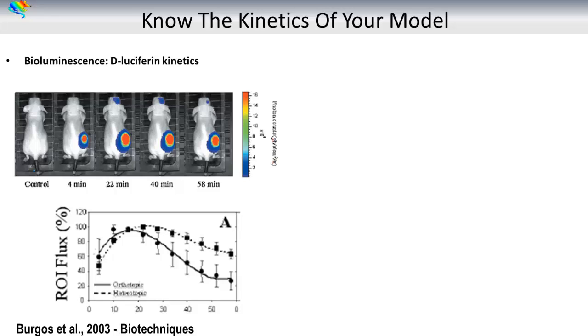D-luciferin is not metabolized. It is a small molecule that freely moves across the cell membrane in a concentration-driven influx and efflux pattern, and it is eliminated from circulation by the kidneys. Upon intraperitoneal injection, D-luciferin is slowly absorbed into circulation and perfuses tissues and cells. Influx is more rapid than efflux, and it is important to determine the peak and plateau phase time points post-injection, as these are the optimal time points for imaging. Upon intraperitoneal delivery, signal will be eliminated 3 to 4 hours post-injection.